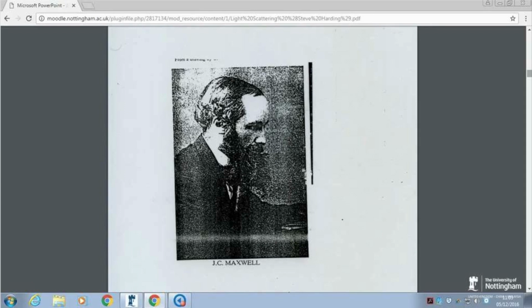That's because of all the moisture droplets which are scattering the light everywhere. This is called turbidity. It's a phenomenon of light scattering, light being absorbed and re-emitted in all directions.